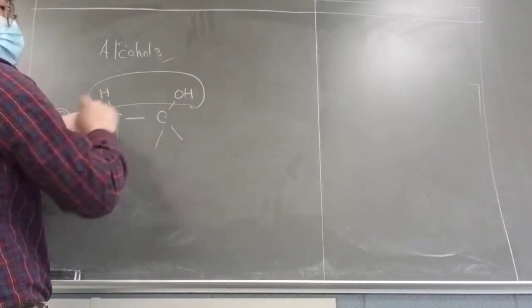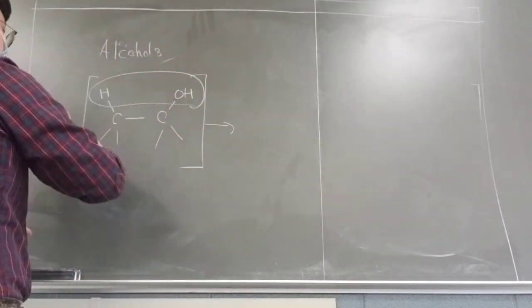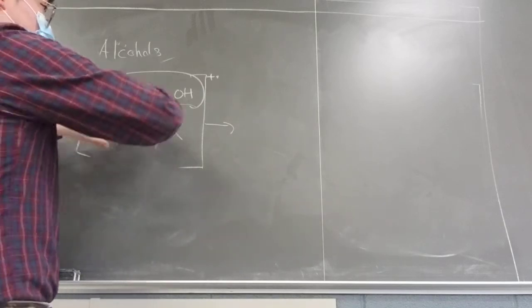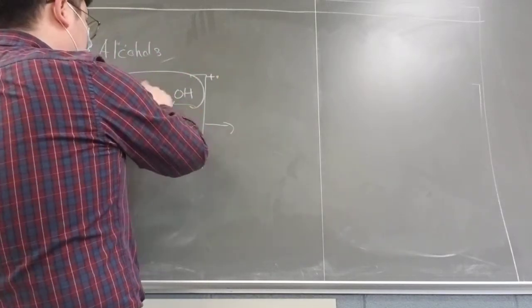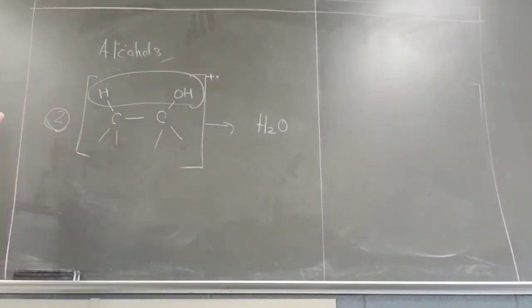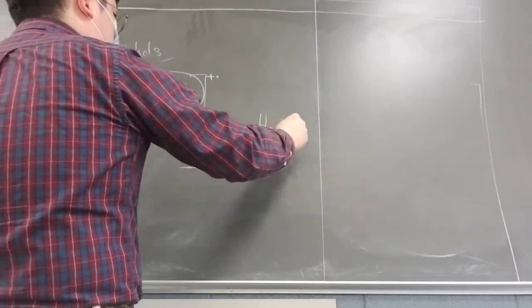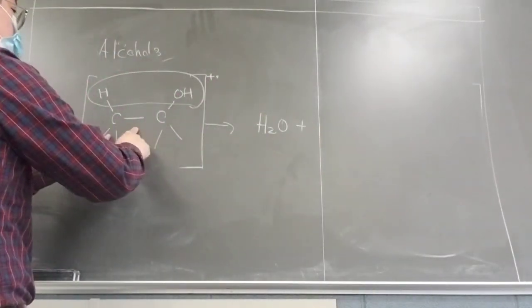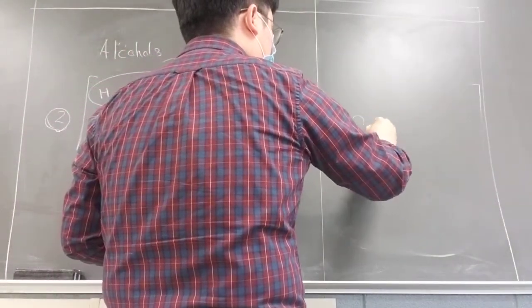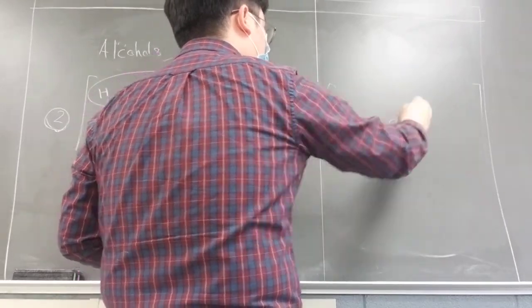This is H2O. If that happens, obviously, this is also an initial electron bombardment, so it's very unstable. That's why they make a small fragment, in the form of water first. This is another possible scenario for the alcohol compound when it fragments in the mass spec. Once the water is lost, they're going to have a double bond in here.